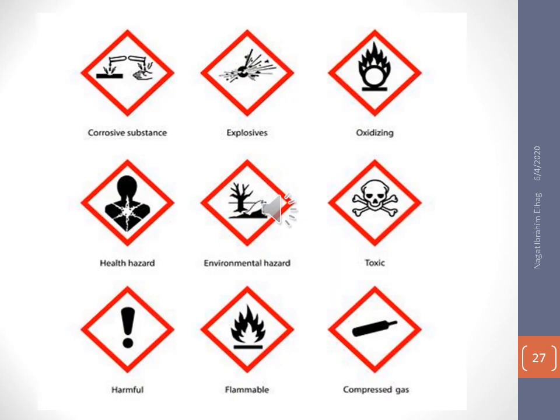You see here in the last slide, there are many types of signs. We have to follow these signs to be safe and healthy, and to make our lab safe and free from risk and danger.